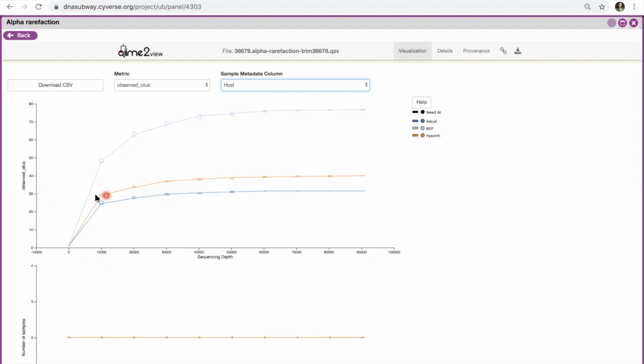It's maybe about 28. And for black-eyed pea, it's the highest. It's 50. So there was a lot of redundancy here. Basically, a lot of these sequences ended up classifying as the same type of bacteria. And that's all we can really say right now. We don't know what type of bacteria they classified as, but there's a lot of redundancy here.